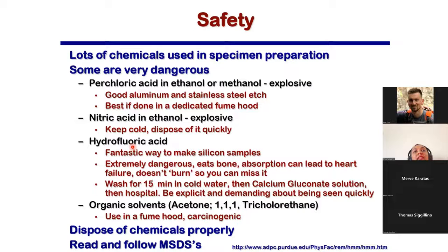All these acids are explosive. We use perchloric acid in ethanol very commonly. I think all the students who are working with iron alloys in Zinkel's group are using perchloric acid. We use it with either ethanol or methanol, and it is a very good etchant. As you see here, we can prepare excellent quality aluminum and stainless steel samples.